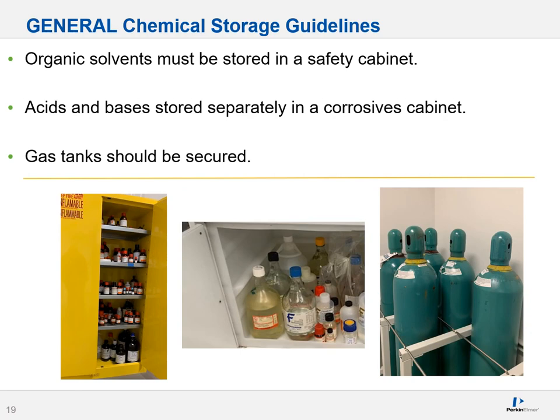I want to provide some general chemical storage guidelines. Organic solvents must be stored in a safety cabinet — by nature they're volatile, can be explosive, and can be quite toxic if fumes are released. Store them in a safety cabinet, preferably one that's vented. Acids and bases must be stored separately in a corrosives or equivalent cabinet. You don't want explosive organics and something with high potential energy like an acid and a base next to each other.